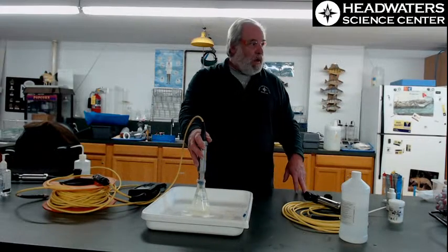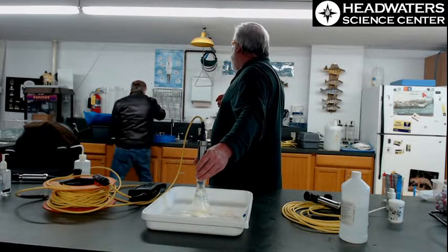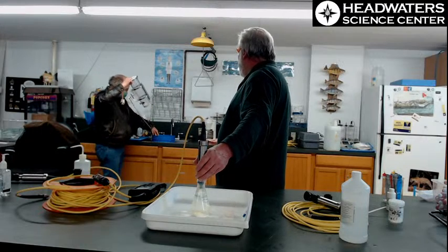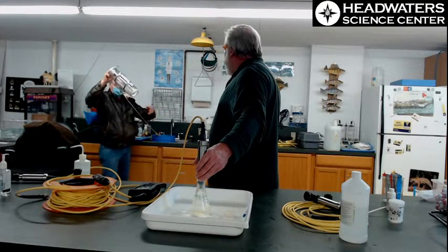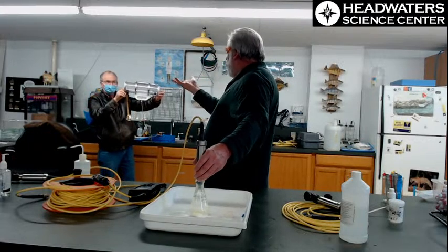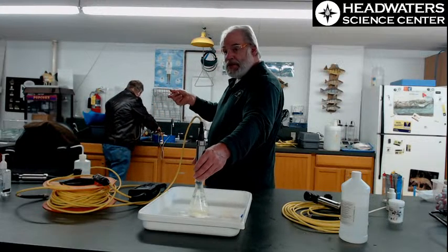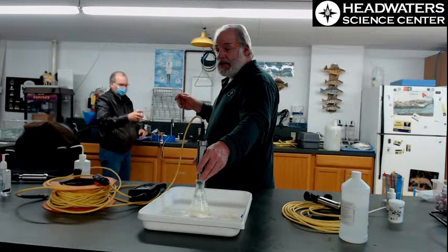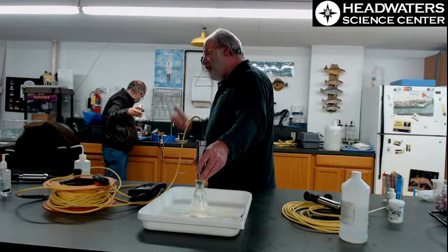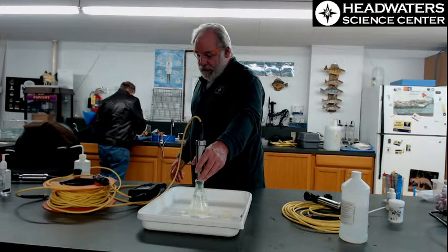Let's show. I'll hold it up. You say what it is. Okay, so it's all in pieces. I take it all apart, and this is the horizontal sampler. We'll drop that down to the level we want to take our water sample at, and the two ends of it will be connected by a rubber band, and they'll close and hold the level. So when we sample in rivers, we sample one-third down, two-thirds up. When we sample in lakes, we go to the deepest part of the lake. We take a surface reading. Then we get a deep one that's just off the bottom, and then we take one every 10 feet in between.